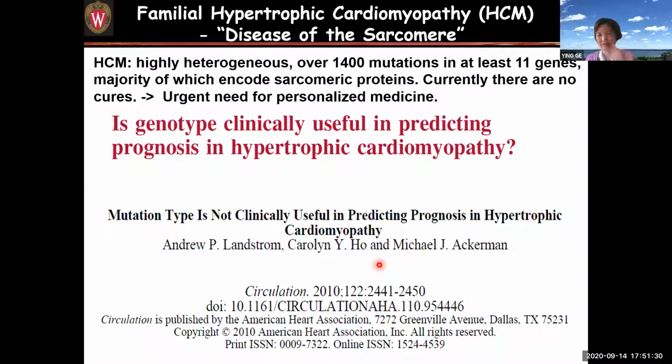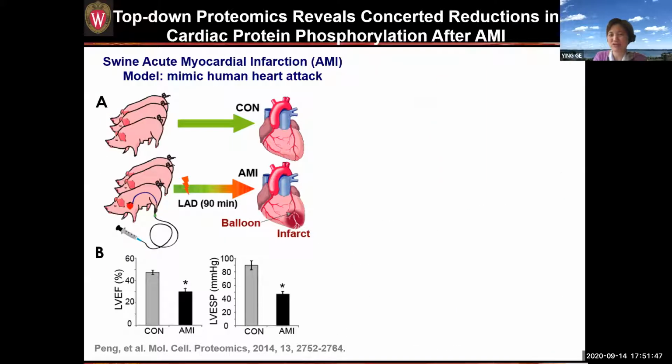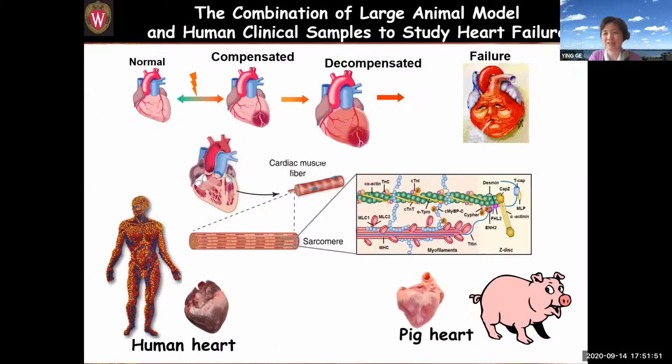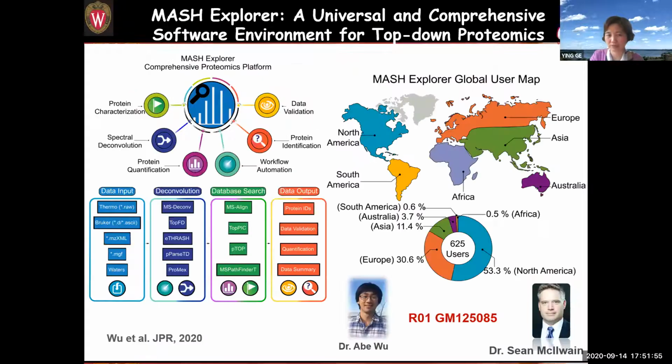They all really want to collaborate with us. And in a very recent publication, I think in Cell Reports, they also have FLASHDeconv. So what we developed essentially is an interface, right? We are not developing unique deconvolution software or searching algorithms.